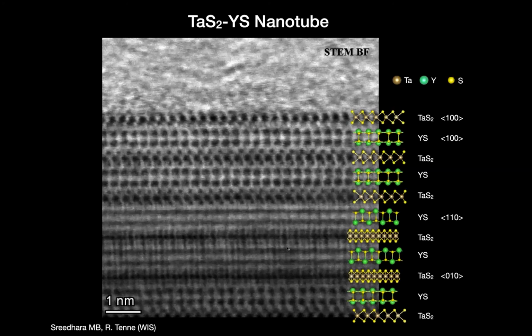HRTEM is not, but the 4D STEM technique would be a candidate to do this. And also there's the technique of electron holography, which would be interesting in that respect. For sure it's a challenge because these magnetic fields are pretty small. The effect on the electron beam is small, much smaller than the effect of the Coulombic potential of the nuclei in the material. So you're trying to look for a signal which is something like 1% of the total signal, and then you're always dealing with noise. And that's again a reason to go for the very modern low noise single electron capable detectors.